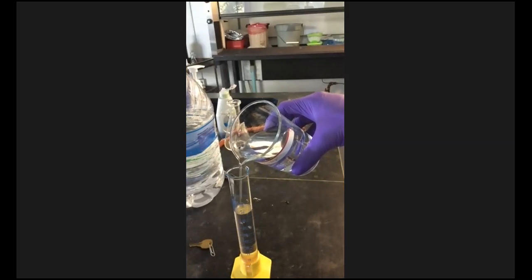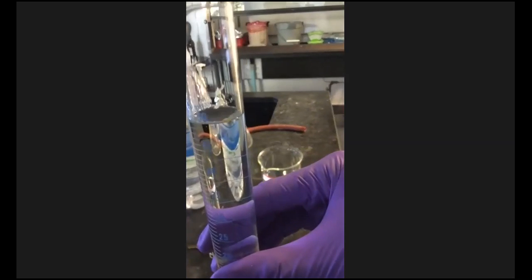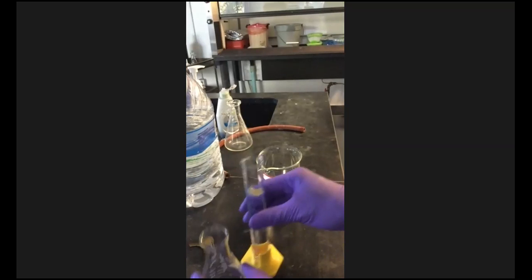And I'm going to go to pouring. I'll stop right at 50. Anybody disagree? All right. So I'm going to add that to here.